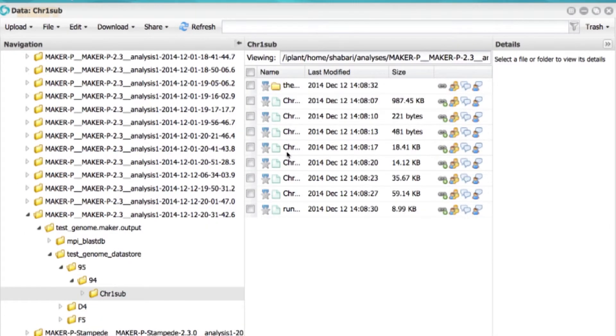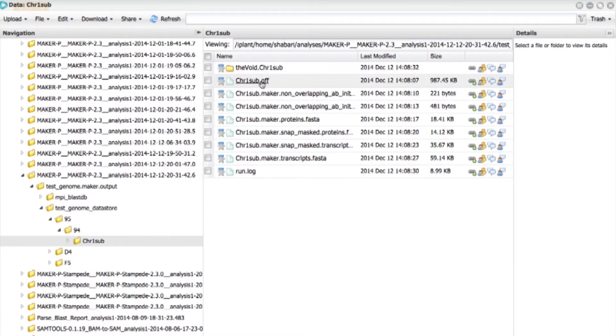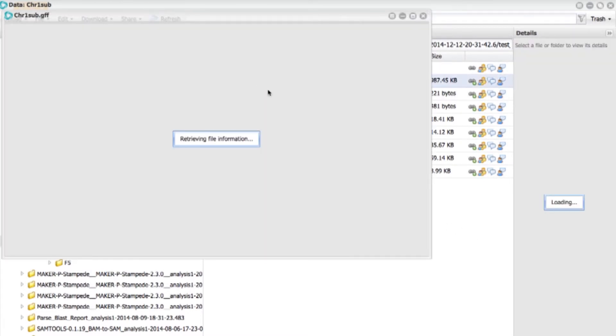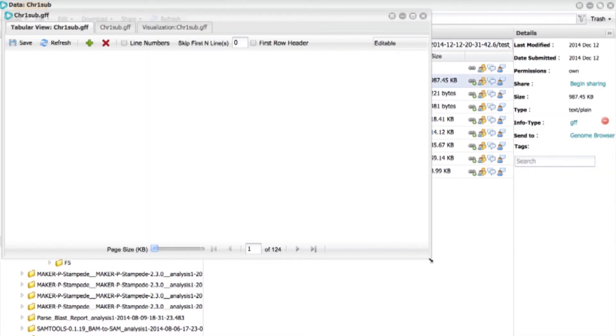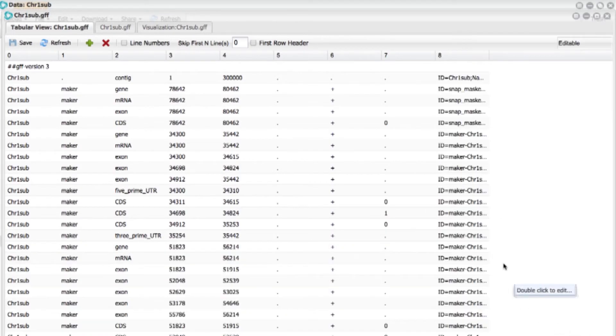And now what you're going to see is it's going to go through the different results file. It's going to open up the GFF with the all the annotations available to you. So I'm rushing through this.